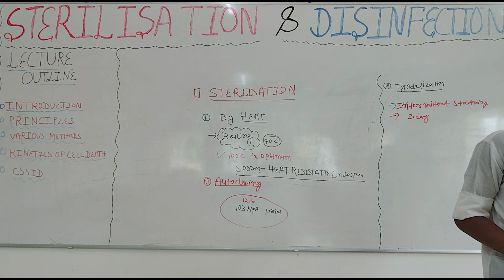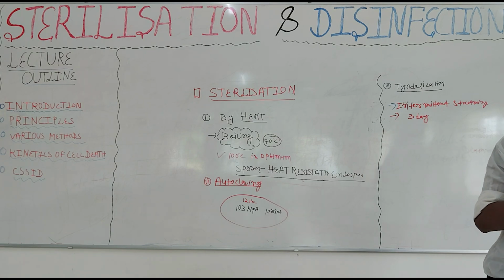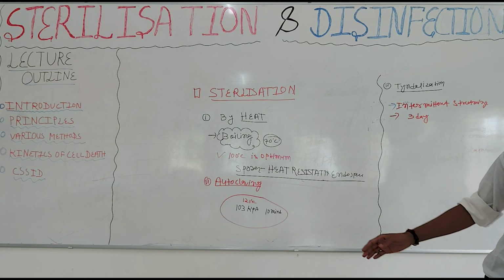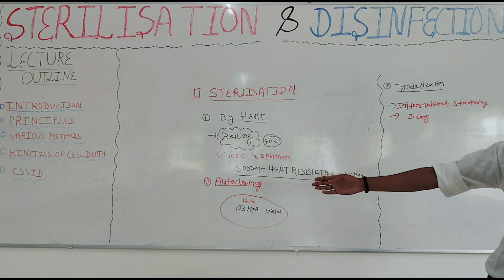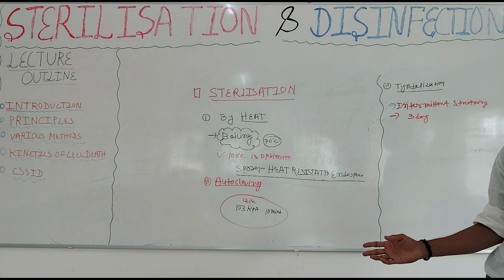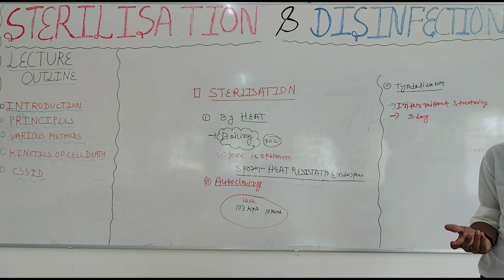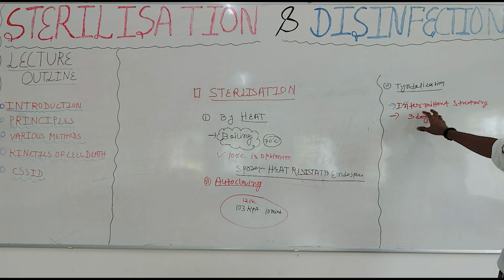So, this sterilization process is used for substances that might be damaged at the high temperature used in autoclaving. As I said, autoclaving is done at a very high temperature, isn't it? And those substances which cannot withstand this much temperature will become non-functional. So for those substances, this sterilization method is applied.